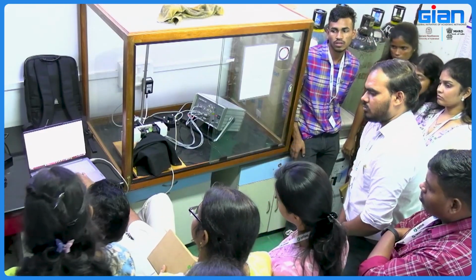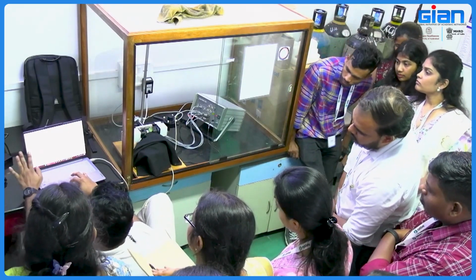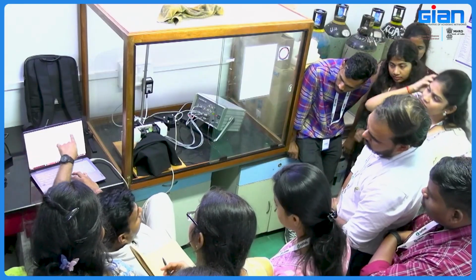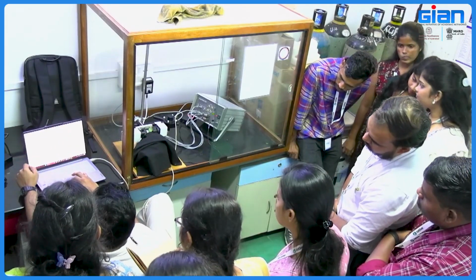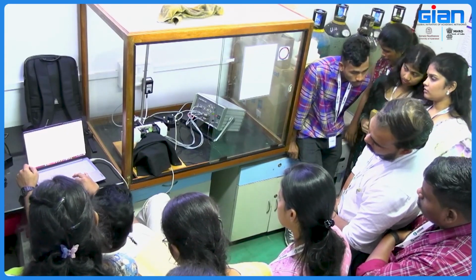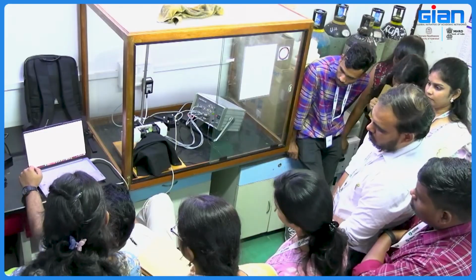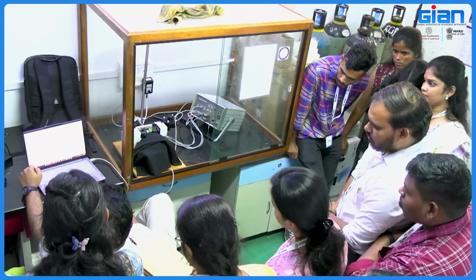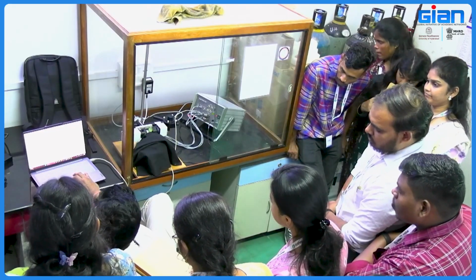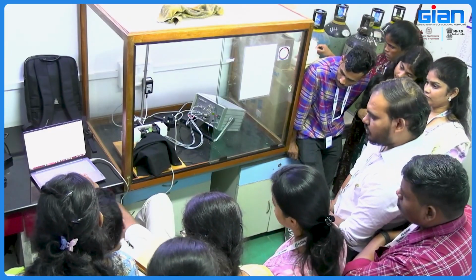Yeah, so once you do this, run it. After the running is done, just make sure you click everything you want to export. So I'm just clicking everything to export. The fitting parameters, the last two, you don't need. All these parameters apart from the last two, then you just export. The export will be in CSV format, so an Excel file will be exported.